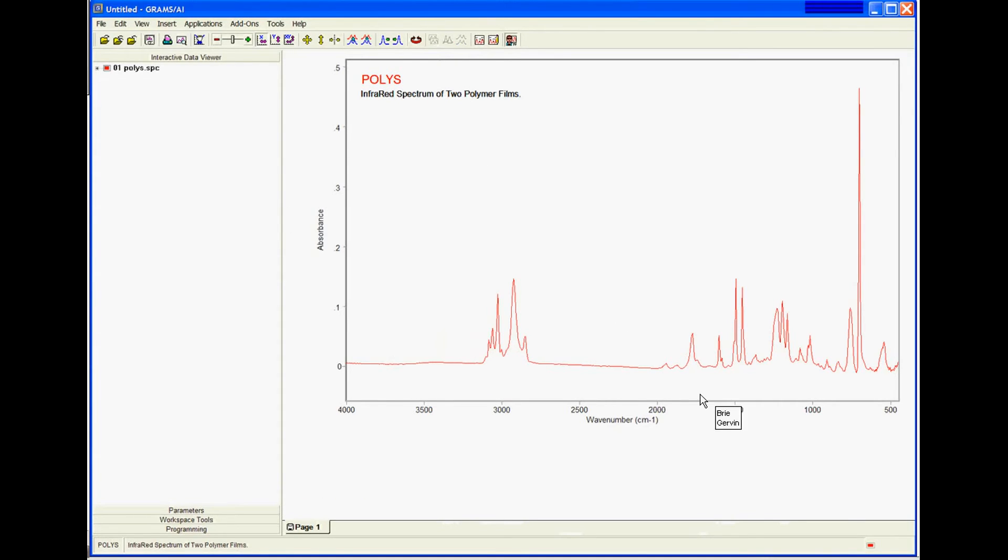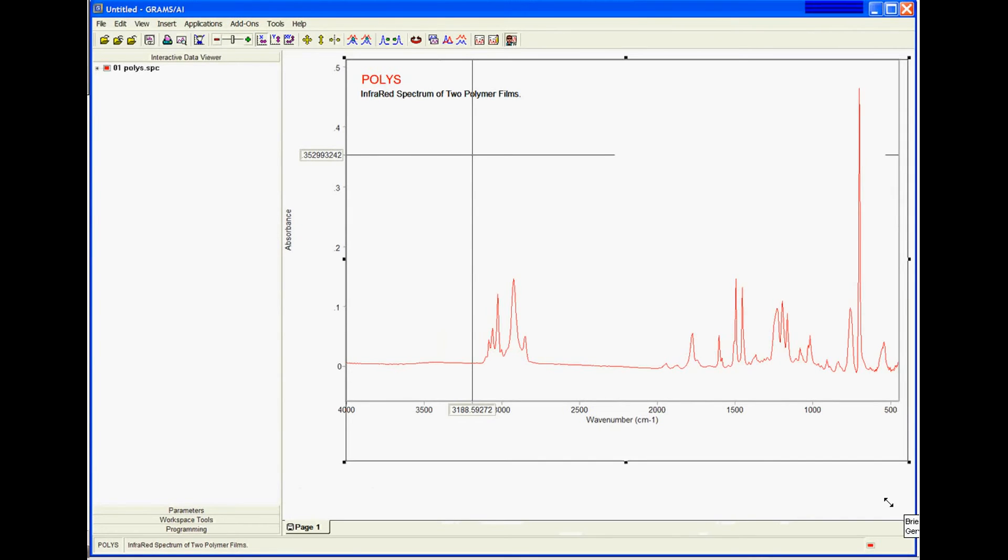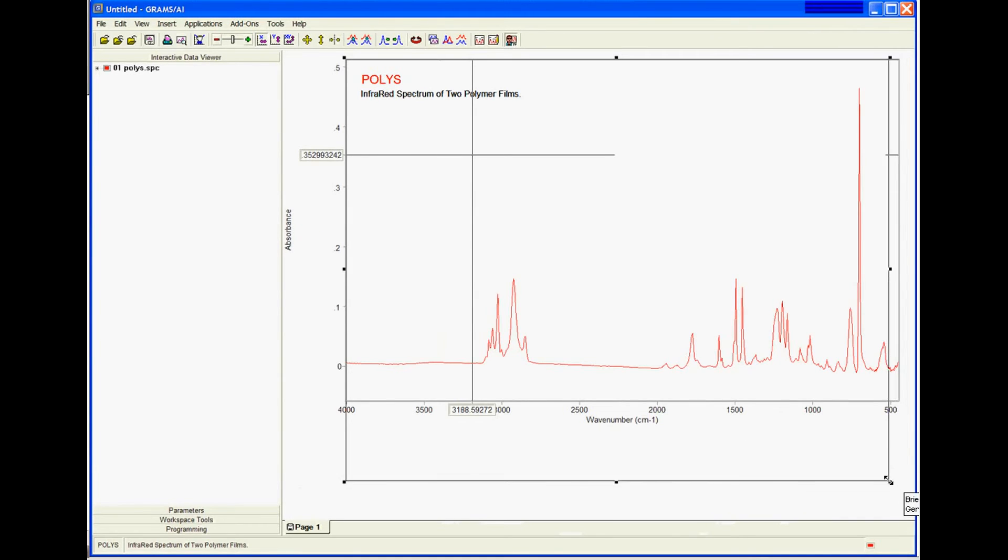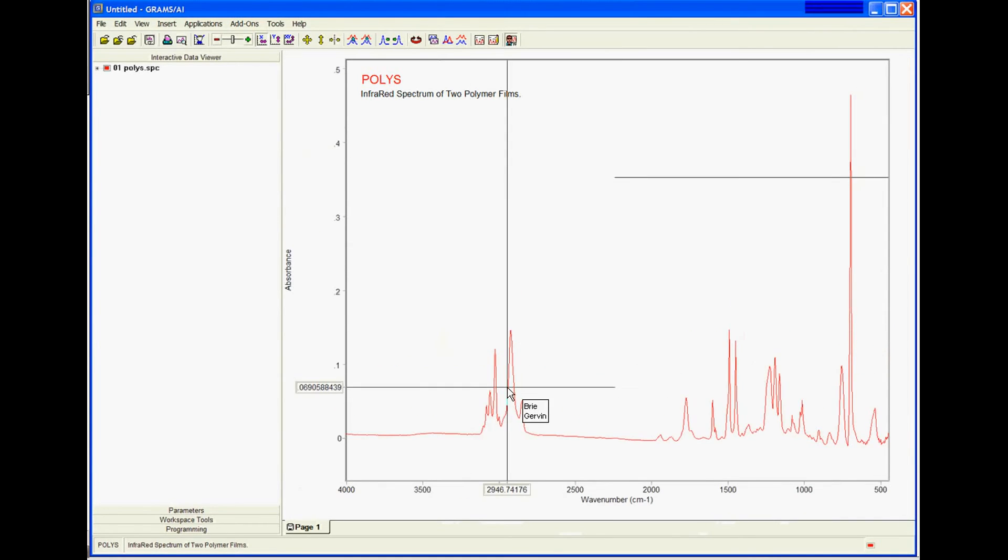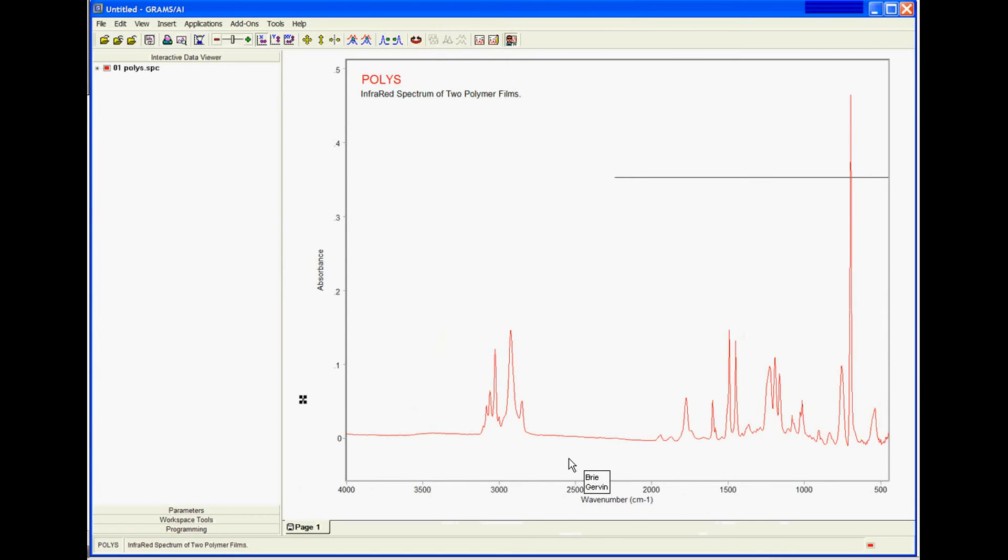And if I choose to make this a little bigger, I can click on the spectral display and make it so it fills up my entire screen.